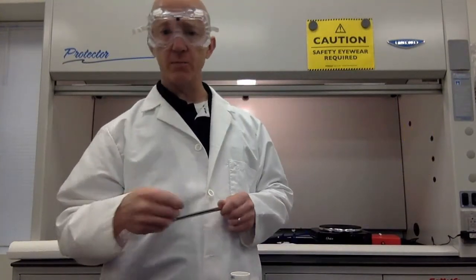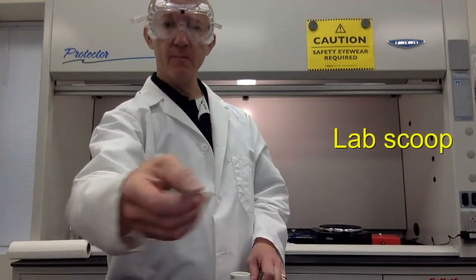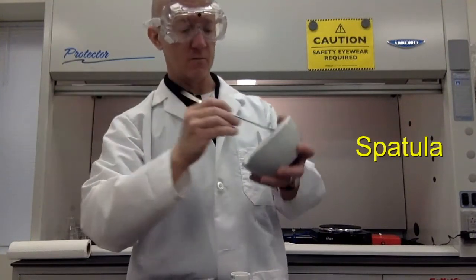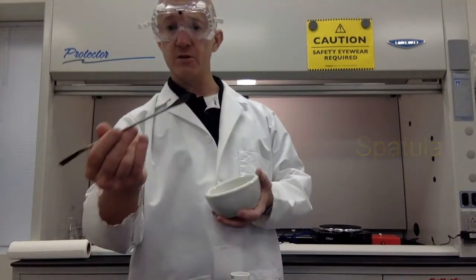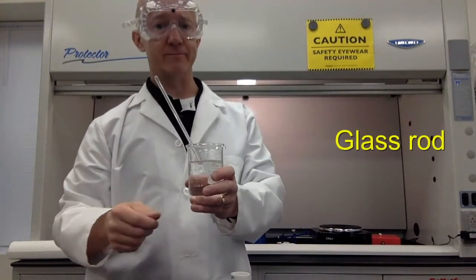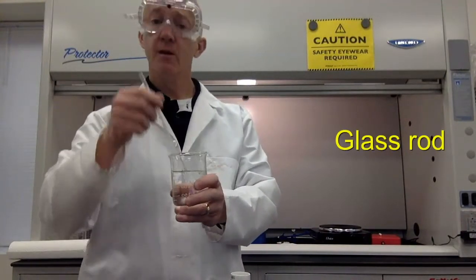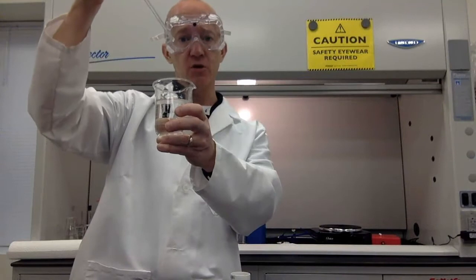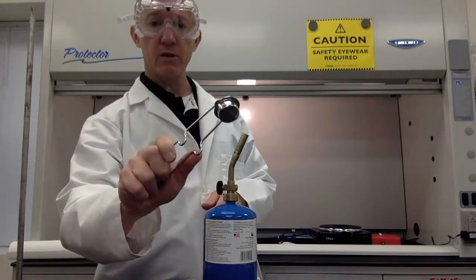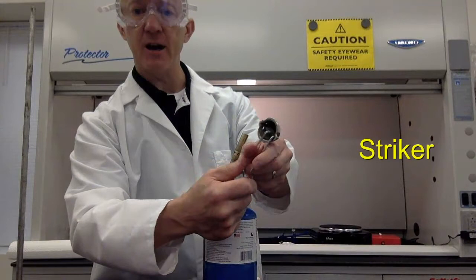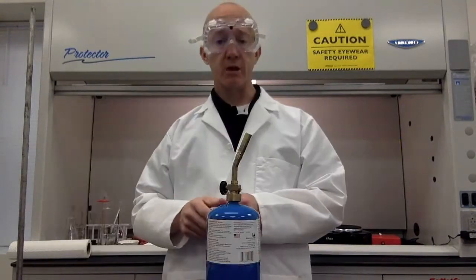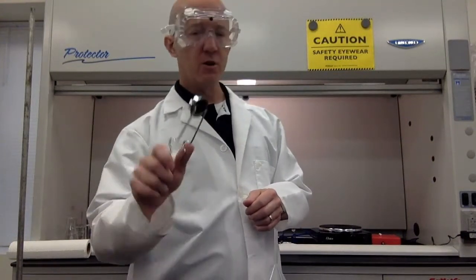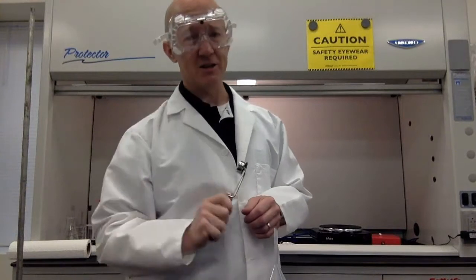Here's some other items you might use during the course of the year. This is a lab scoop. It's used for scooping solids. This is called a metal spatula. We use it for transferring solids. This is called a glass stirring rod. I hope I don't have to explain why. A glass stirring rod is also good for transferring drops at a time of solution. To light a torch we use one of these. This is called a striker. It has a piece of flint inside that produces sparks. So we carefully turn on the gas and we spark like so. Now please don't be wasteful. Don't wear out the flint just because you want to see it spark.